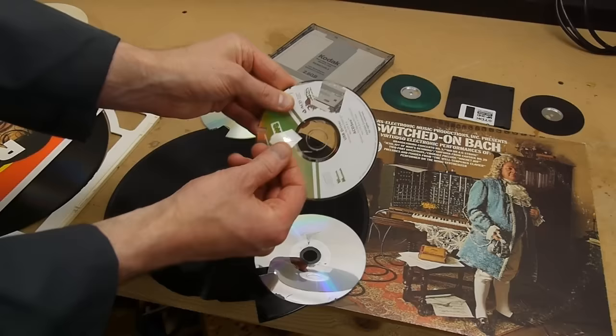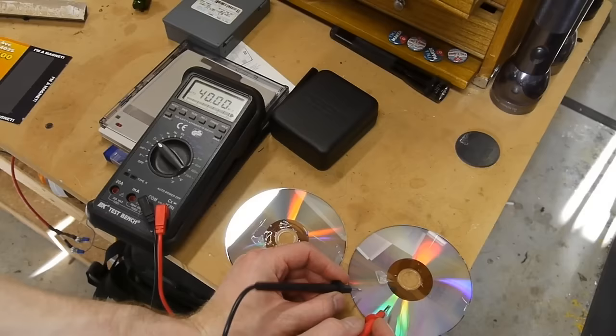And now we have a really fresh sample of aluminum here. If you come in with a multimeter this is actually quite conductive. This is bare aluminum exposed. So here's what the CD-ROM looks like.